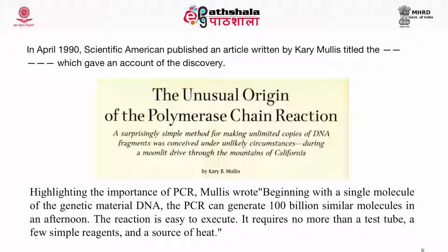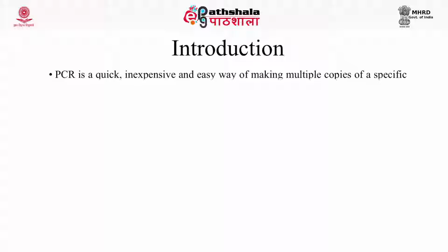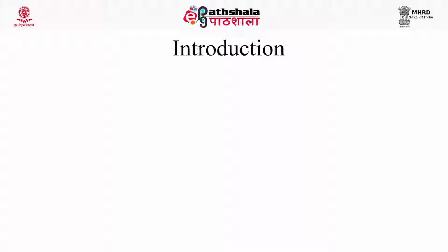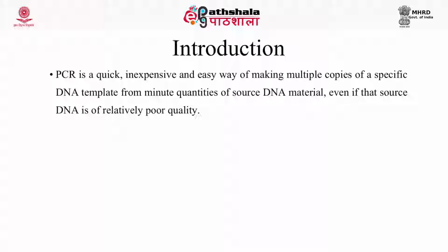Now let us discuss the simple technique of PCR, which is very useful in molecular diagnostics. PCR is a quick and inexpensive way to create a number of copies of a single DNA segment. Now let us understand this PCR or polymerase chain reaction in detail. PCR is a quick and inexpensive way to make multiple copies of a targeted DNA. These multiple copies of a specific DNA can be formed from a very minute quantity of starting material.